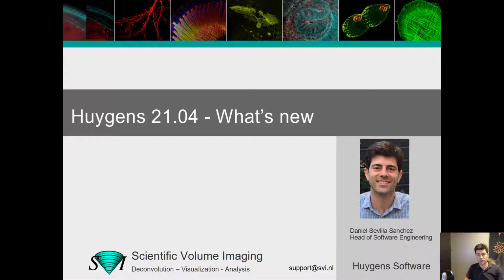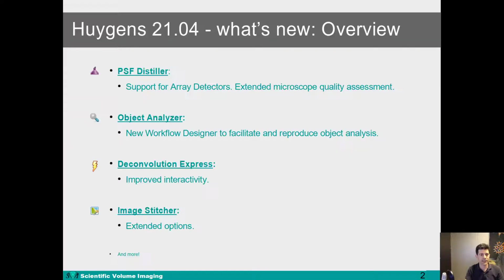I'm head of software engineering at Scientific Volume Imaging, and today I would like to talk to you about the new features and improvements that we have brought into the latest Huygens 2104 release. So let me first show you an overview of what will be discussed during the webinar.